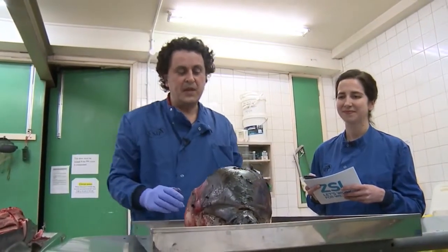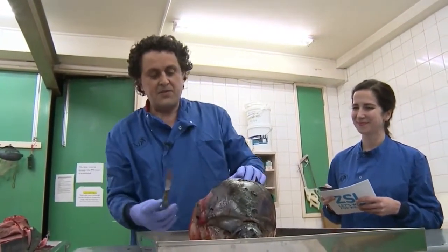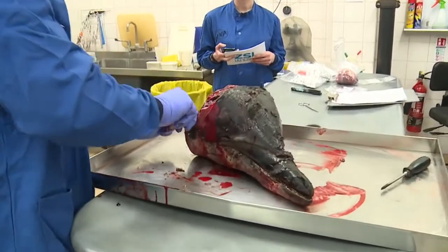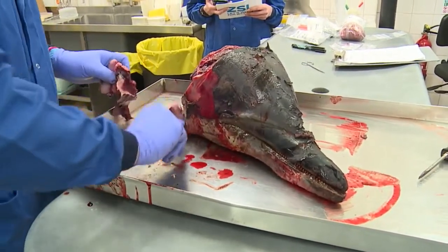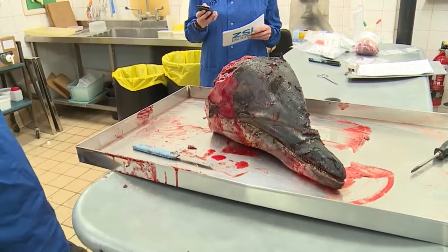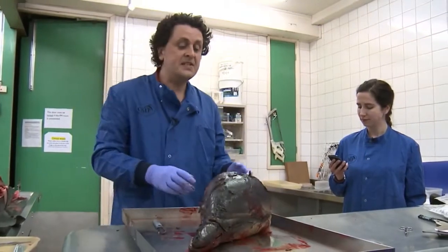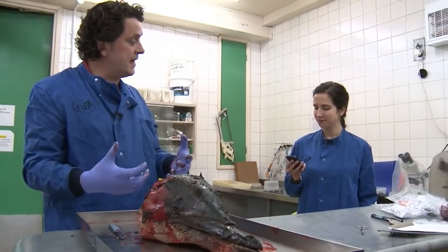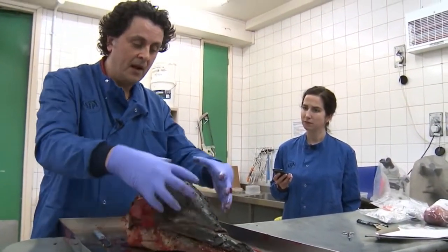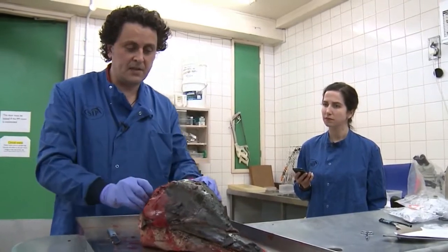Okay, the next thing we will do is, I think we're going to take the brain out. And then if we have time, we'll talk about echolocation. So I've trimmed some tissue off the back of the skull, just to expose the skull. If we rewind a little bit, go back to first principles, there are two groups of cetacean. There are the odontocetes with teeth, like this one here, and then mysticetes. Mysticetes don't have teeth, they have baleen instead, and that's part of their feeding ecology as well. All odontocetes have the melon. This is a soft fleshy mass here. This is all soft tissue. The skull is actually here with the brain on the inside.